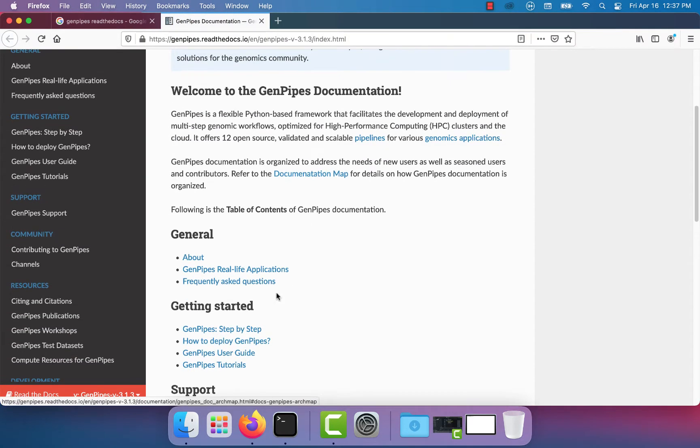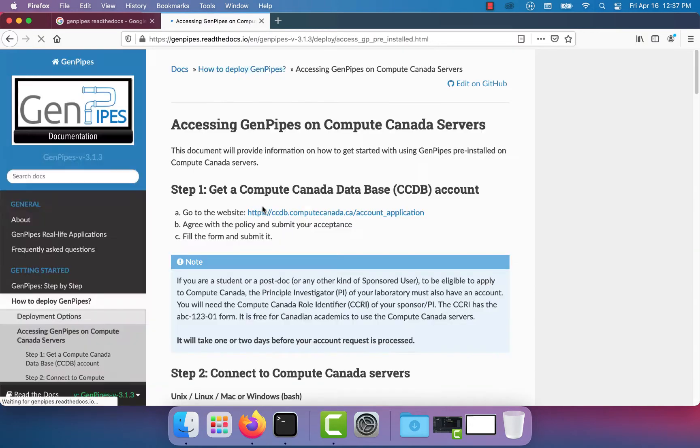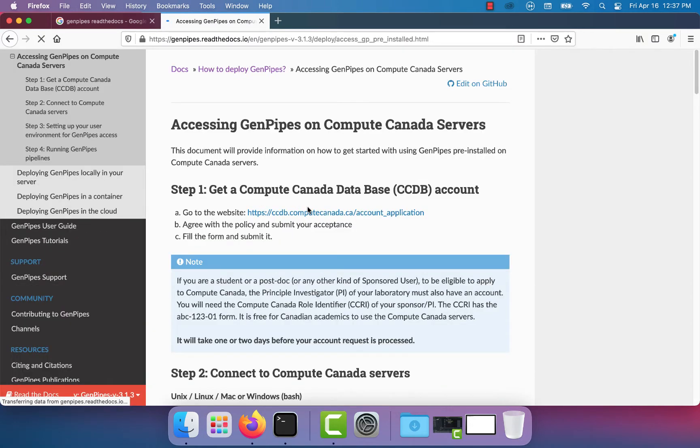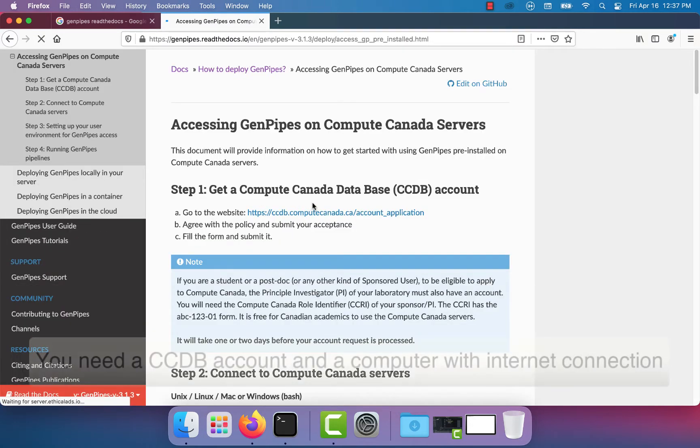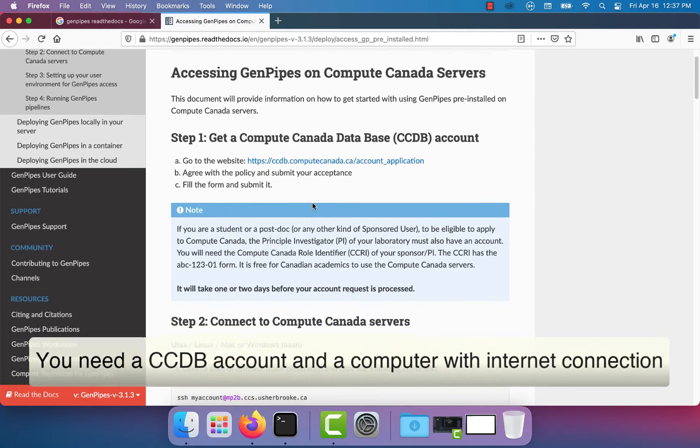Next scroll through the page and click on how to deploy GenPipes. Then click the link for accessing GenPipes on Compute Canada servers. To run GenPipes on a cluster all you need is a Compute Canada database account and a computer with internet access.